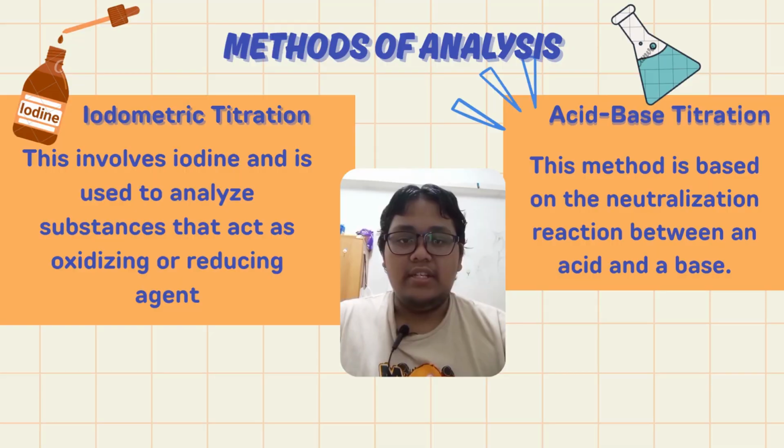Now this titration is called acid-base titration. Another example of titration is iodometric titration. This titration uses iodine instead of acid or base.